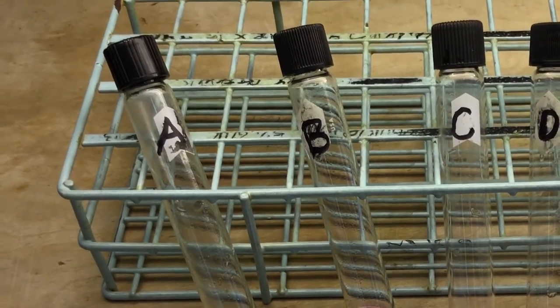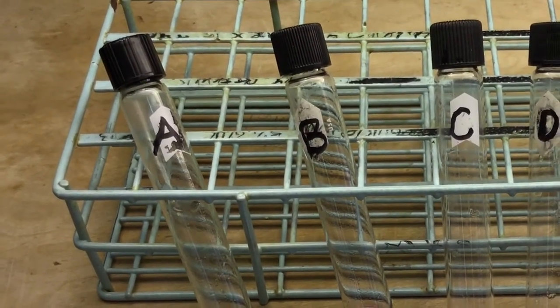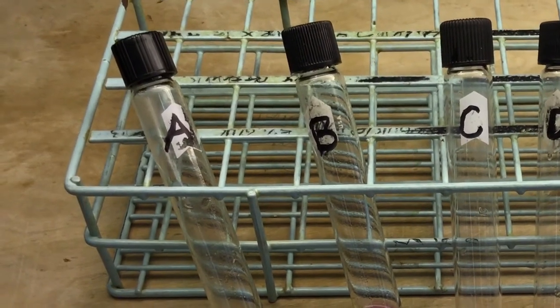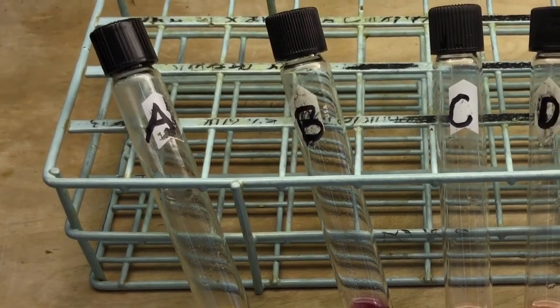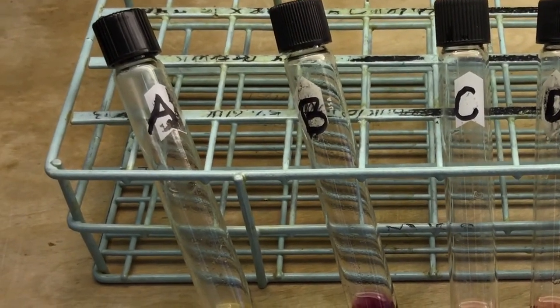When writing up this experiment, think about the two processes, photosynthesis and respiration, in terms of whether or not they may or may not be occurring, relating this to the color change in the bicarbonate indicator.